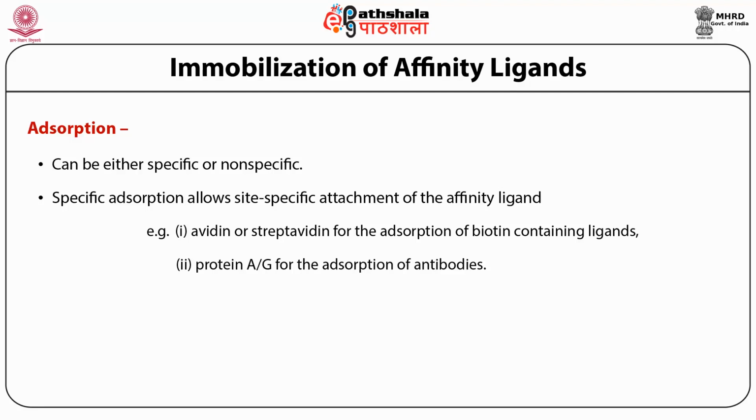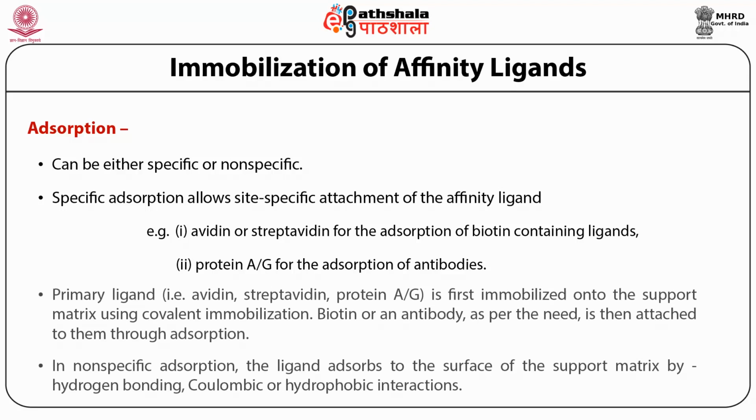In the specific adsorption method, the primary ligand such as streptavidin, avidin, or protein A/G is first immobilized on the solid matrix using covalent immobilization, that is, the amine reactive method. Biotin or an antibody, as per the need, is then attached to them through adsorption.